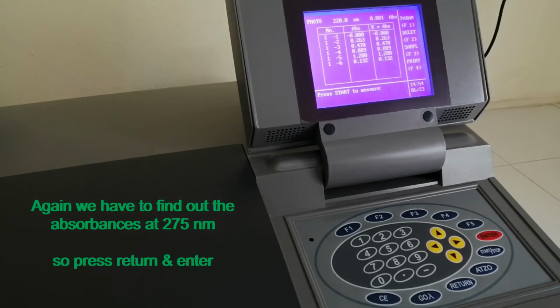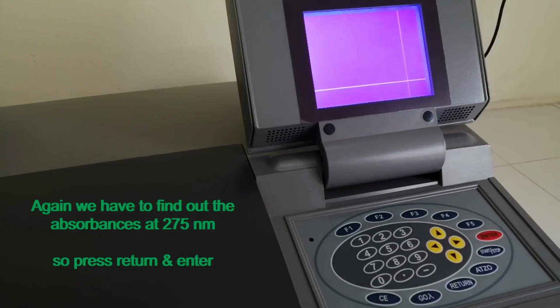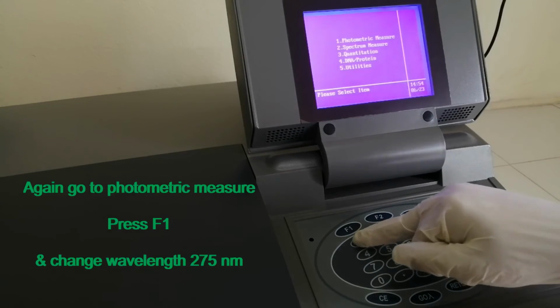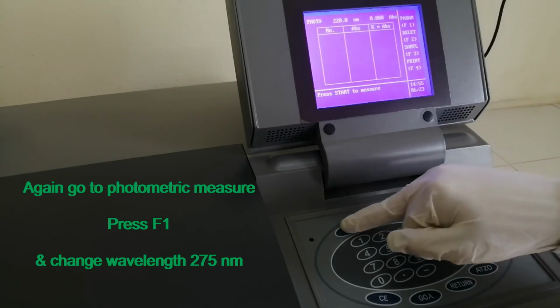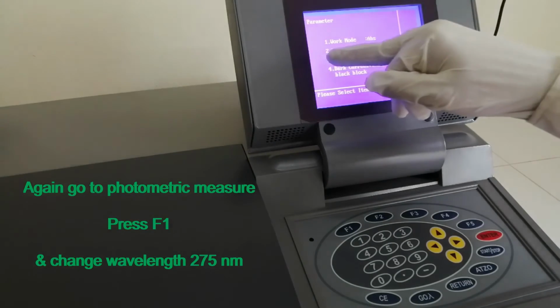Again, we have to find out absorbances at 275 nanometer. So press return and enter. Again, go to photometric measure. Press F1 and change wavelength to 275 nanometer.